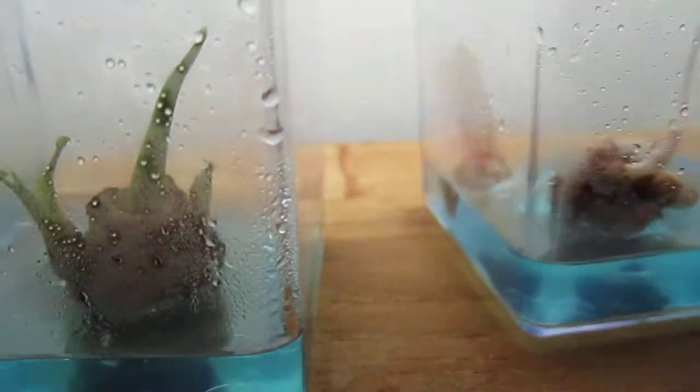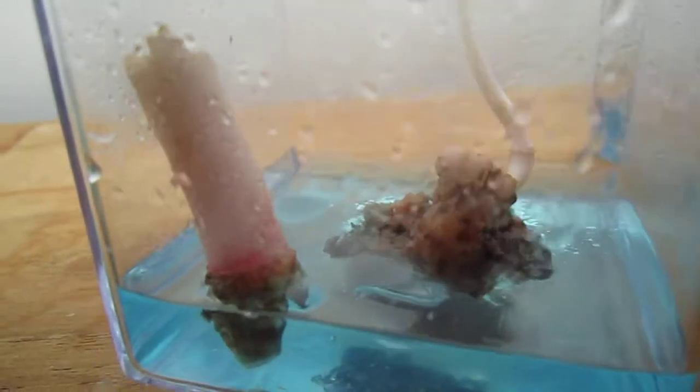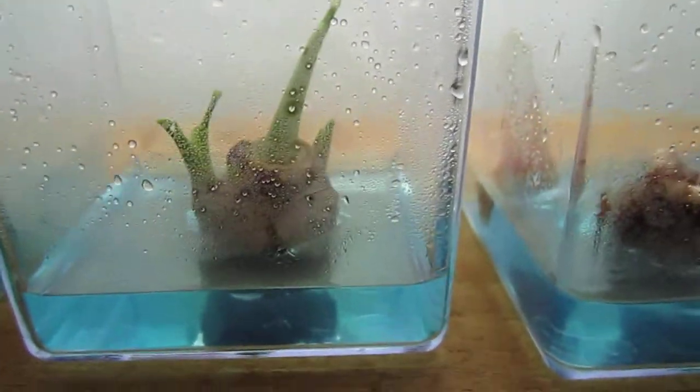And next to it is one I just planted yesterday. This is the mana ulu. Hopefully it will grow up to be something good — I don't really know yet. Kind of chancy, these things. It's like my first try, and so far this is the most successful one.